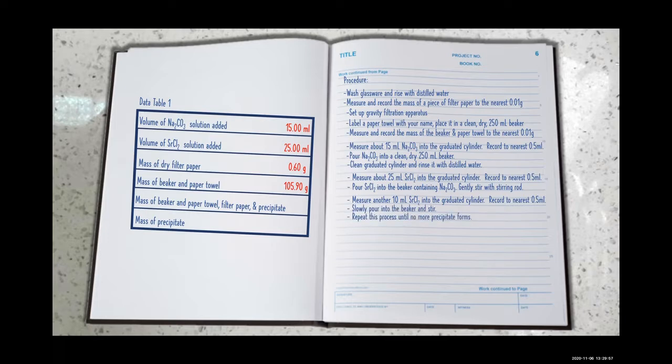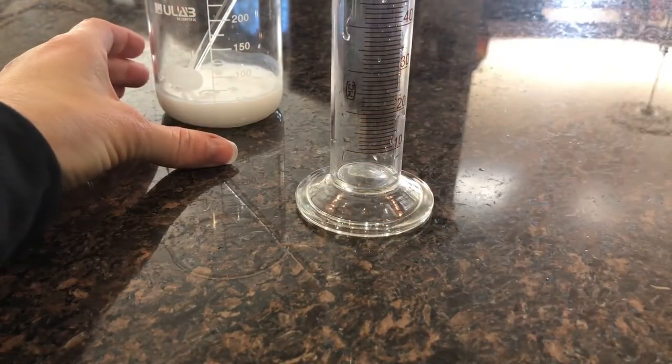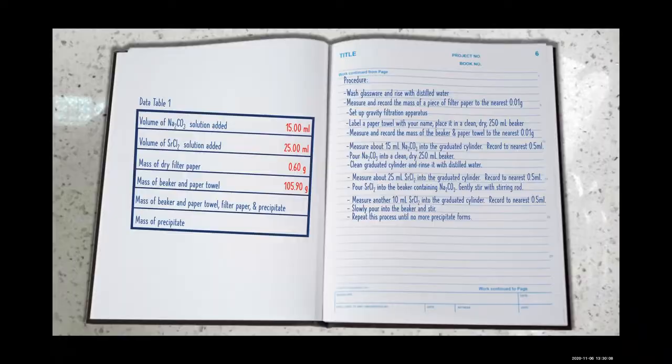We'll slowly pour this into the beaker and stir, and then repeat the process until no more precipitate forms. We'll allow the precipitate to settle, and then slowly pour the contents of the beaker through the funnel.